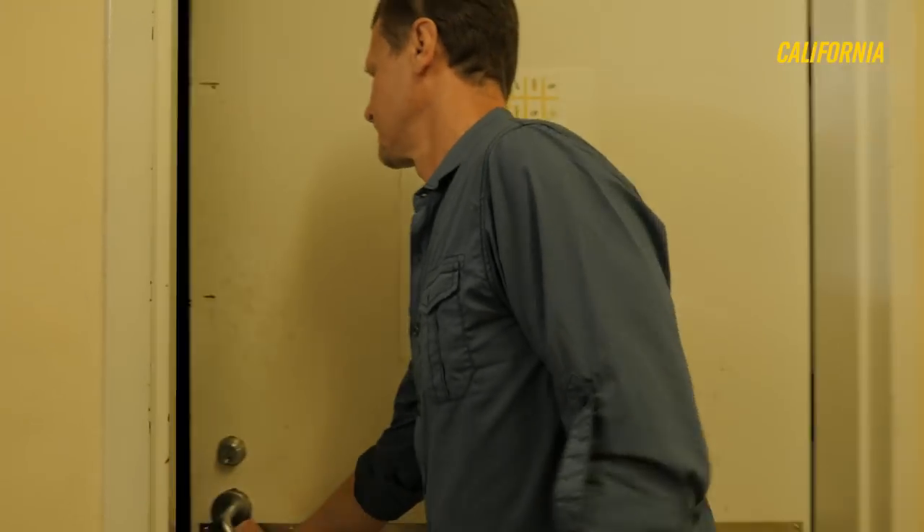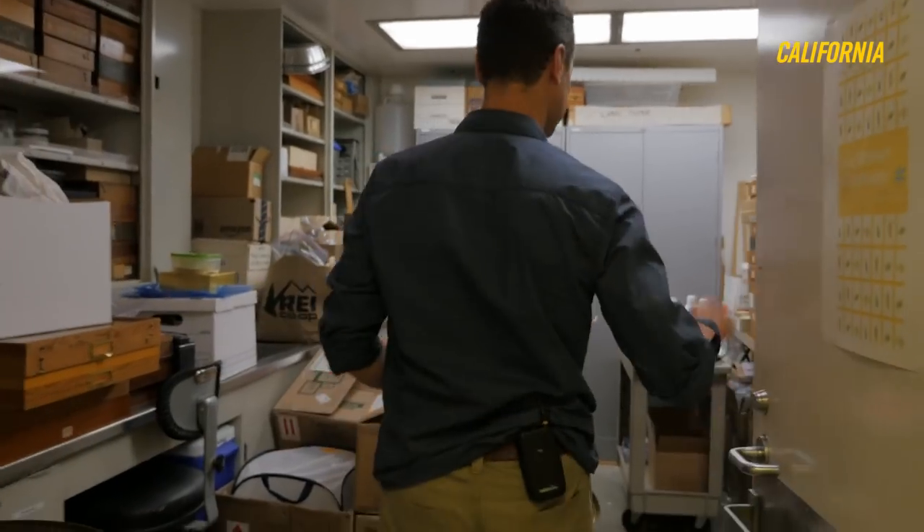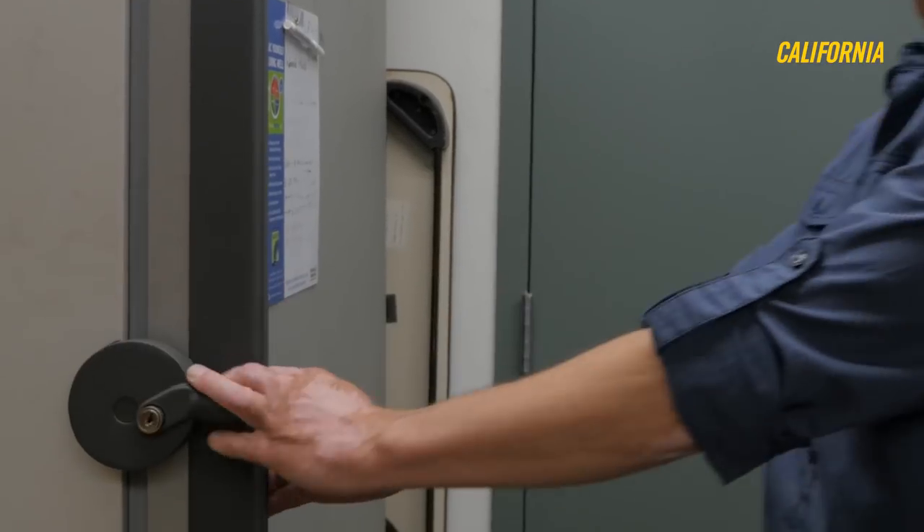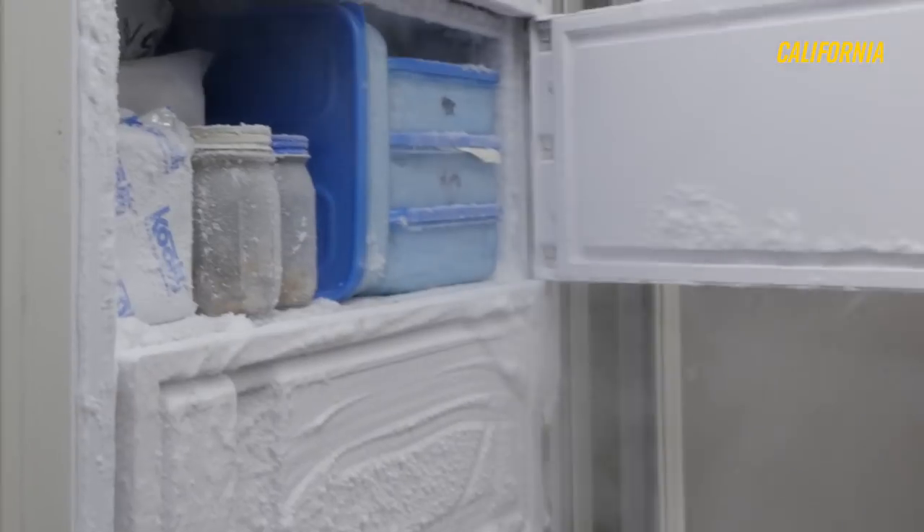When I bring the specimens back, they're not all beautifully spread like this — this takes quite a bit of preparation. This is our field room. We don't bring any specimens into the museum until they've gone through our minus 80 degree freezer for at least three days. We want to be sure not to bring any pests into the collection that can damage it.